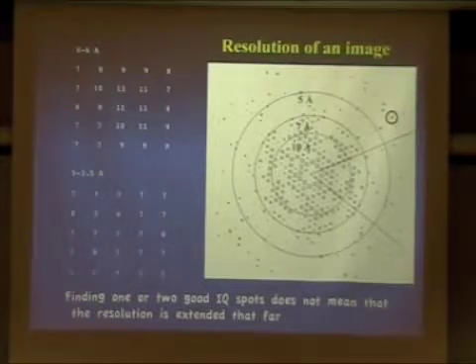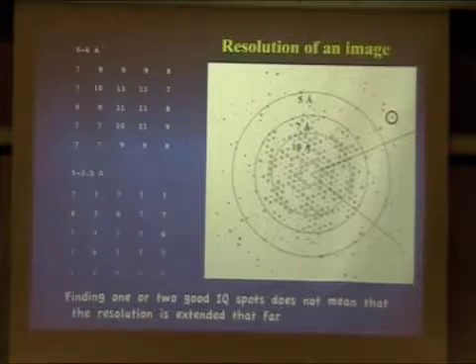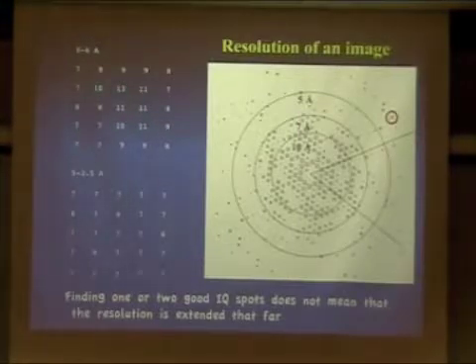Okay, so one way of figuring out if these are real peaks is to integrate all those boxes that I was talking about when I make the spot. Then you'll be able to see, if you add all those up, whether you have a peak above the background or not. Okay.